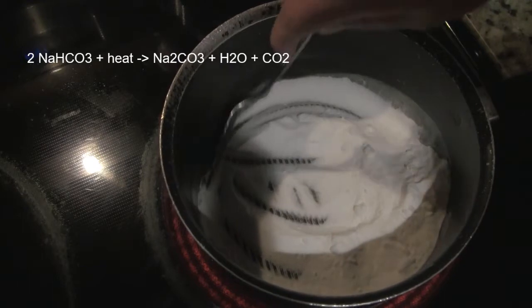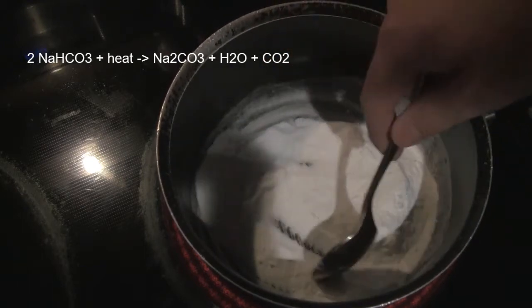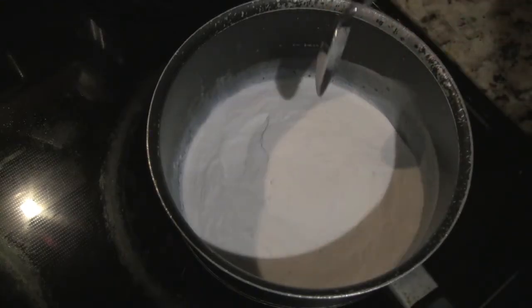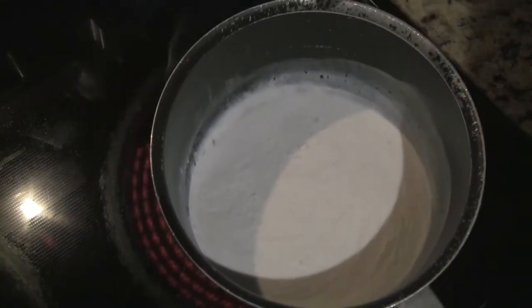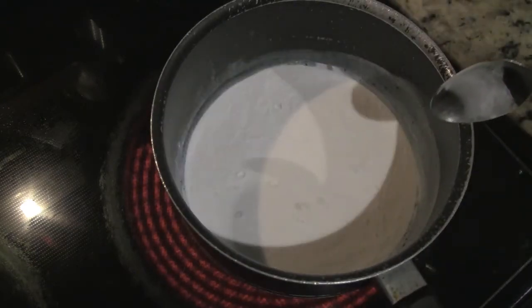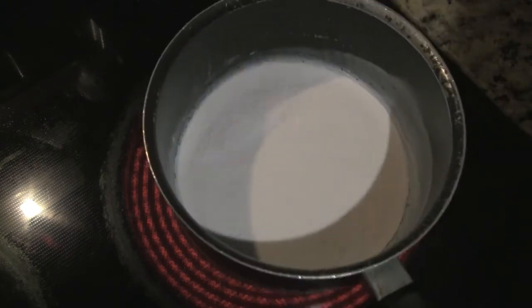With heating, the sodium bicarbonate releases some water and carbon dioxide while leaving the sodium carbonate behind. During the reaction, the solid powder will start to clump up due to the water being released. It will start to thin out and flow similar to that of liquid. This weird effect is due to the carbon dioxide being released during the reaction.